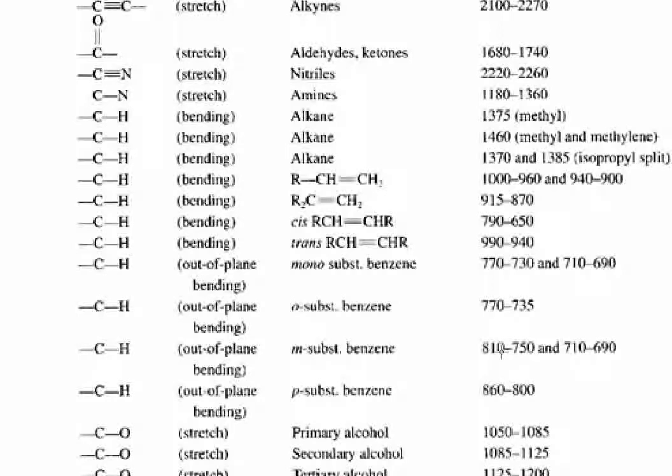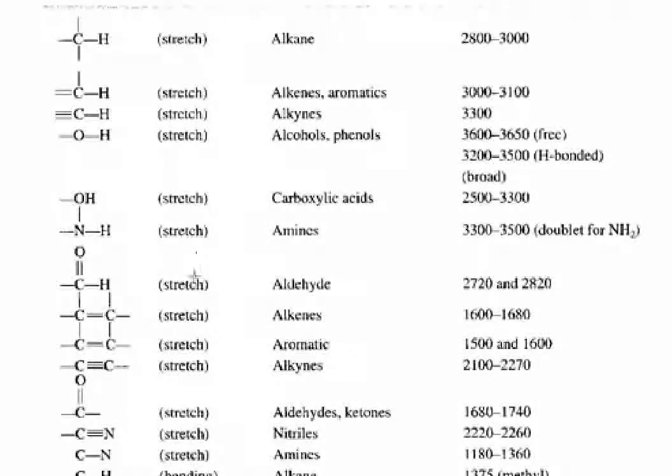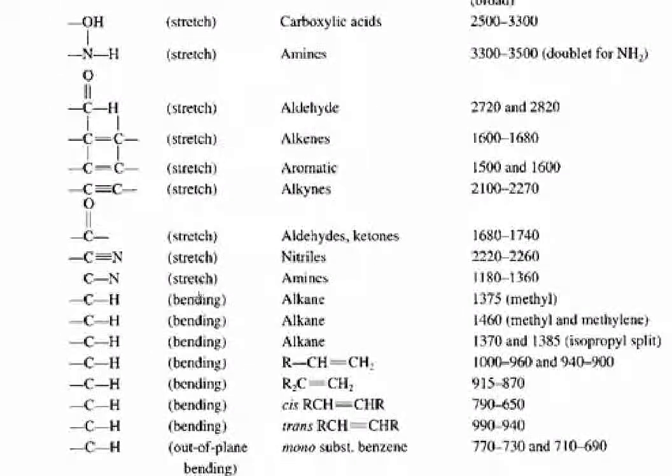So one thing to point out at this juncture is that when you're interpreting an IR spectrum, you want to focus on interpreting the left half of the spectrum where your stretching bands are, and completely ignore, at least at the beginning, the bending bands, because they're too difficult to make a correlation between a given frequency and a possible bond or functional group. So when you're interpreting an IR spectrum, and we're going to review this later on, stay with the left half. Your task is to use the stretching frequencies to try to identify what functional groups are in your molecule, and to stay away, at least initially, from making that kind of interpretation from the bending peaks. Don't even examine them, at least at first.